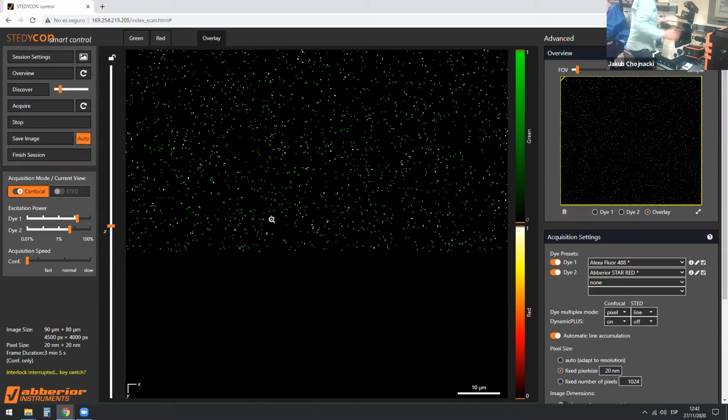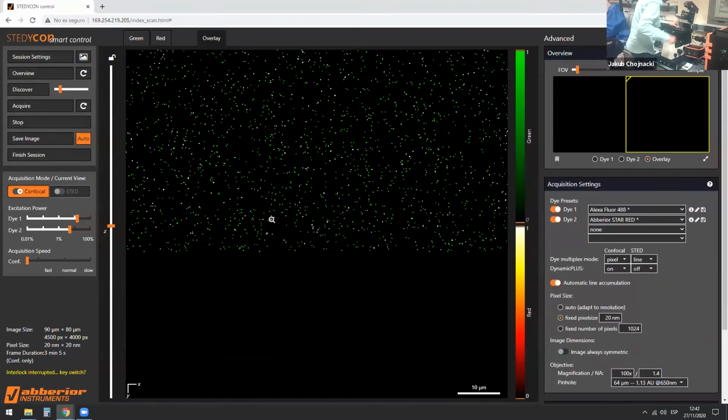All right, so I'm going now to put the microscope sample on the objective here. Hopefully you can see this as I do. I know the camera is a little bit limited, but hopefully you can still see enough. Okay, so I'm putting the sample, securing it here.